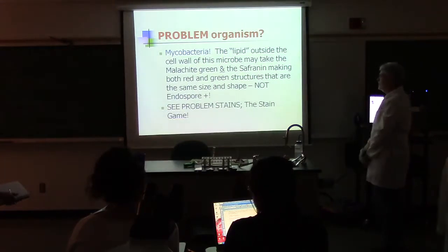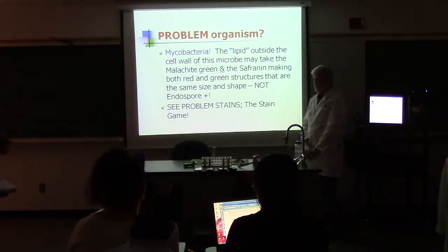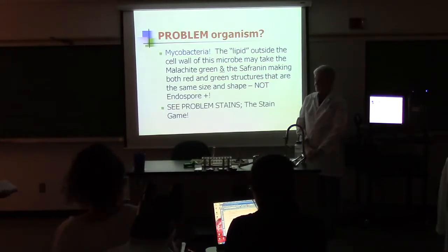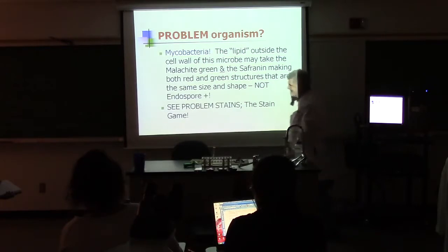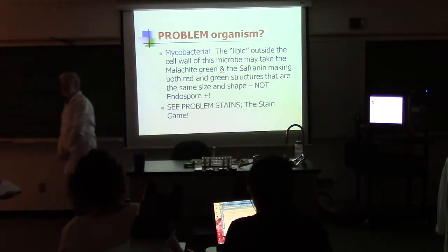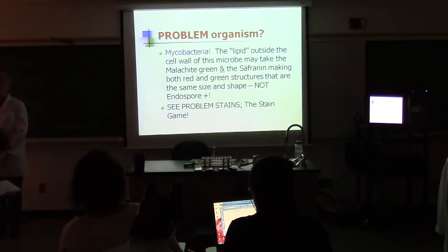All right, so let's talk about the one that makes everybody cry. Every one of you is going to miss it. Mycobacteria takes the green. Remember, anything hard to stain under heat will absorb the primary stain.